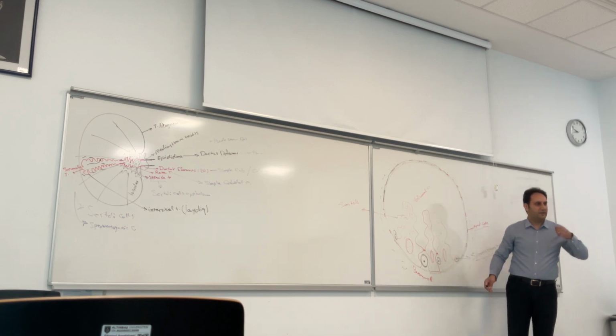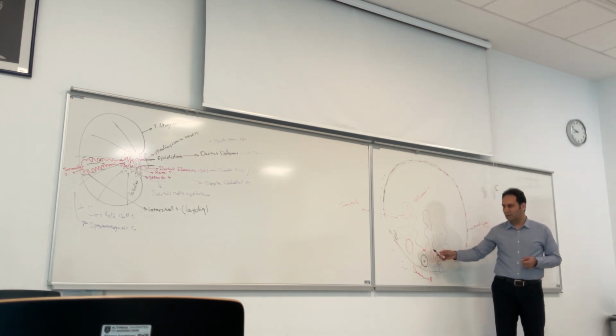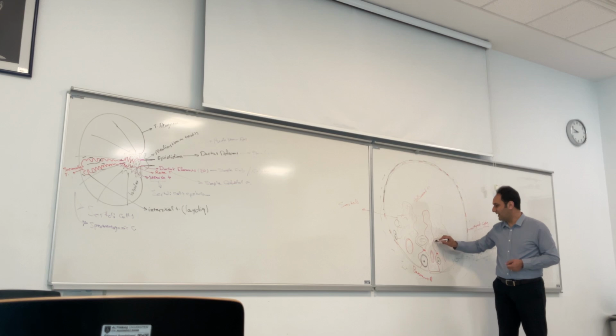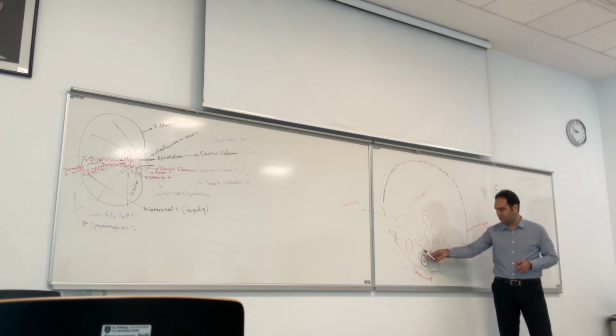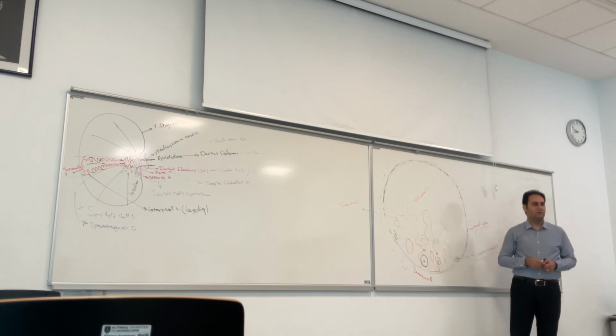The cell which enters meiosis can pass through the connection and enter this area. In this area, these cells have a different DNA structure and are a type of foreign cell for our immune system. Because of that, Sertoli cells protect these cells with the blood-testis barrier. Okay, can you understand this part?